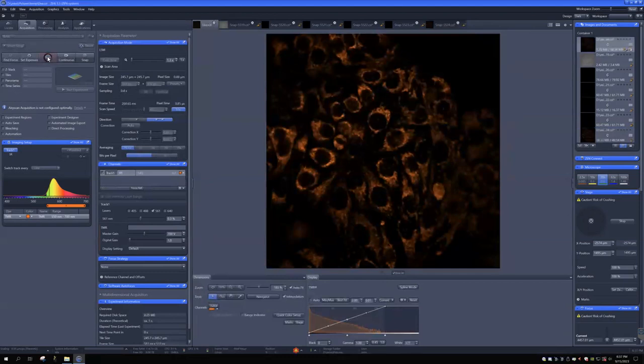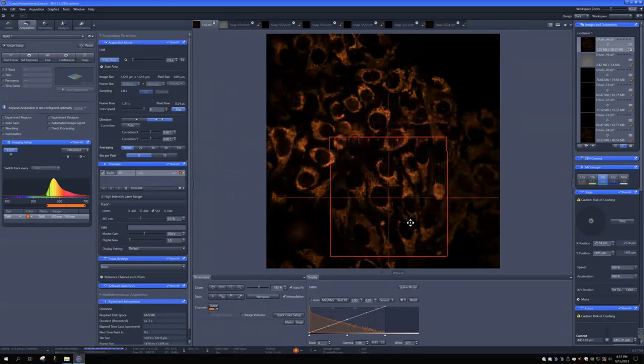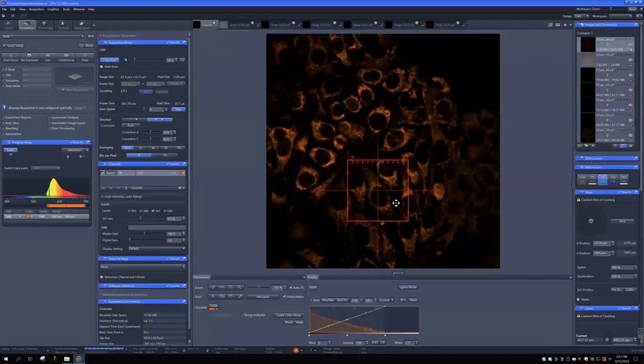If we want to look at, for example, a specific cell like this one here, we can do crop area, focusing on that cell. If we don't want other images, we can just change the area size here until it fits our region of interest. For example, right now I set the ratio to 5. That's telling us that if you do another snapshot, the image size is going to be 63 micrometer square. It's only going to take an image of this place.